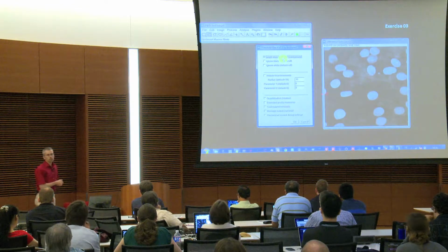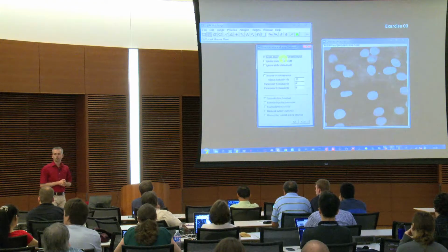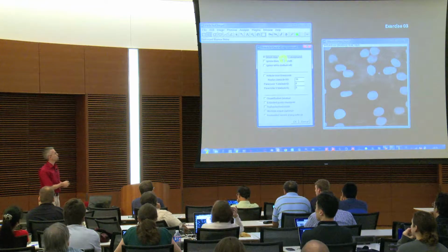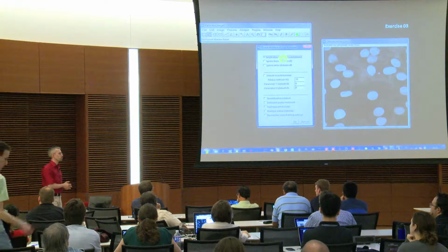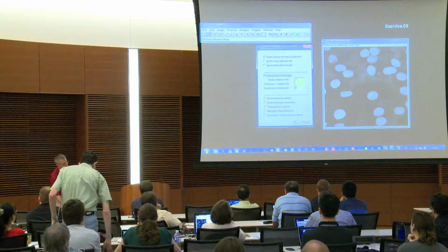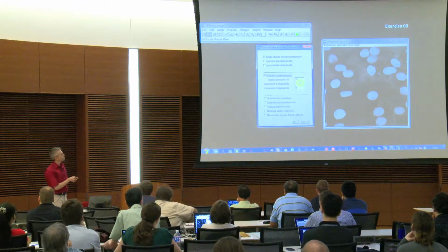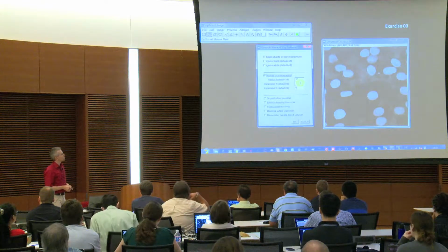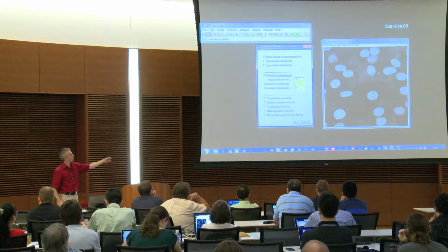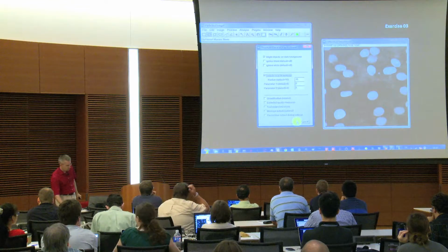The middle part is interesting for local thresholds. That's getting more complicated. In most cases, that's also often not so helpful because it extracts in addition a lot of the background. You can have a look at that, so if you want to, you can switch it on. But it's difficult to find suitable parameters, so again, the user bias is increasing. So I would try the global ones first. What some of those functions are good for, I'll explain later on. First of all, we run it like you see it here.